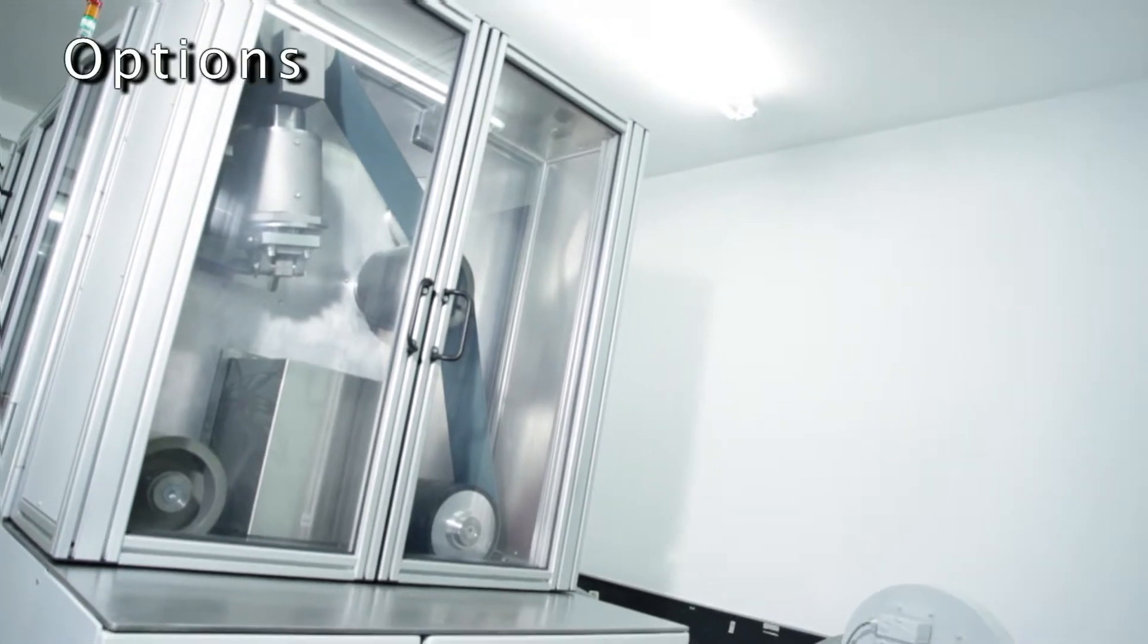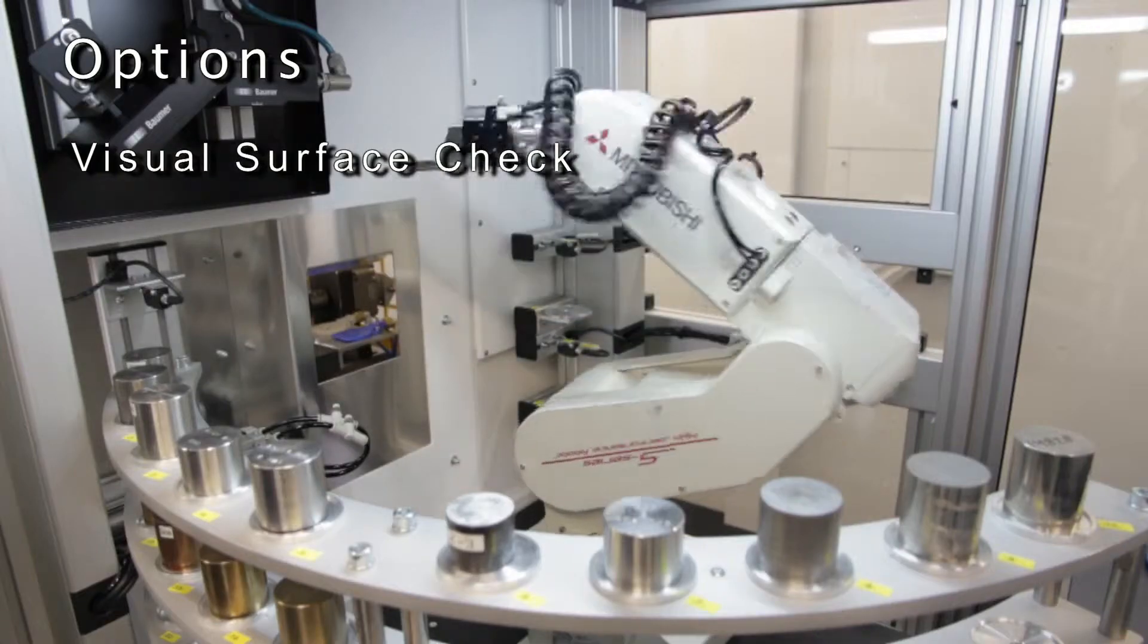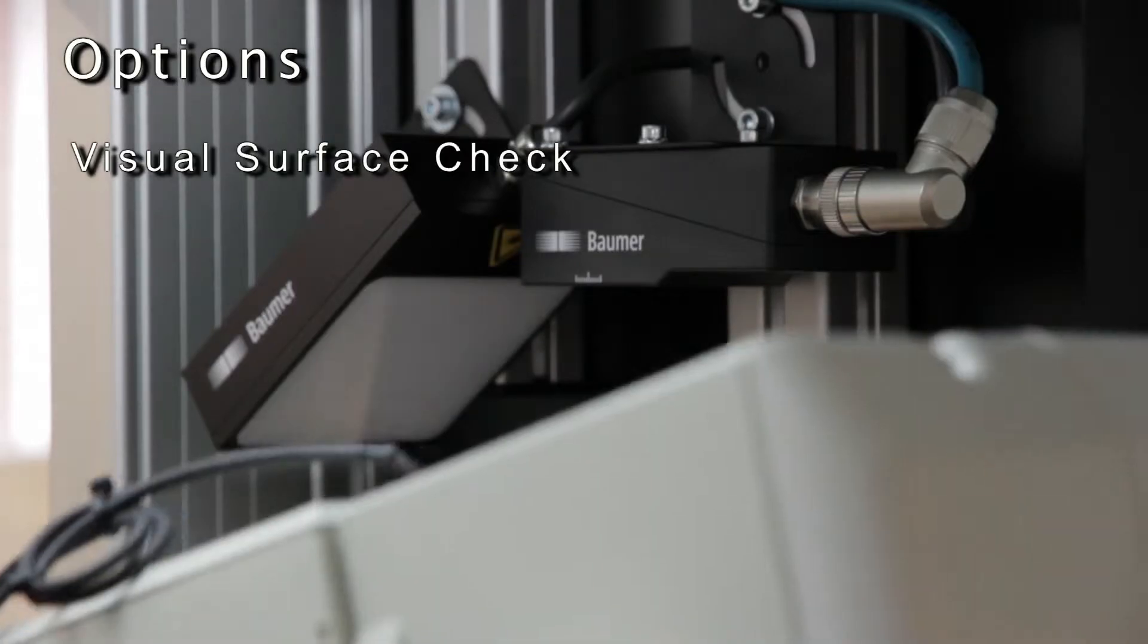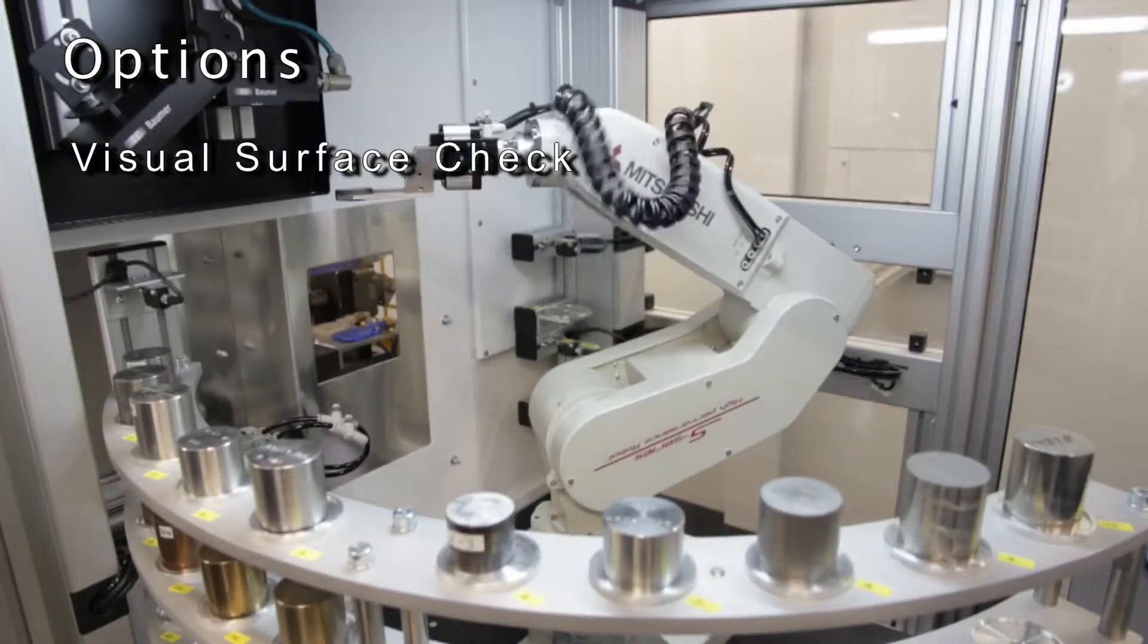Further options include visual surface check to identify inclusions, best sparking positions, or reject samples before measurement.